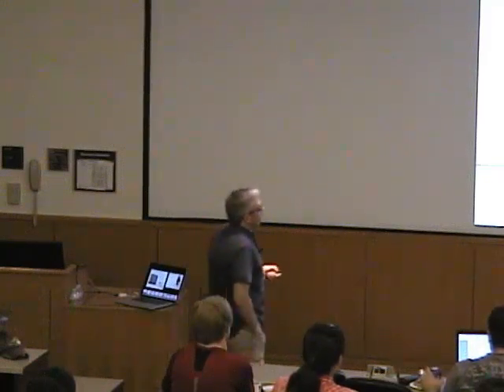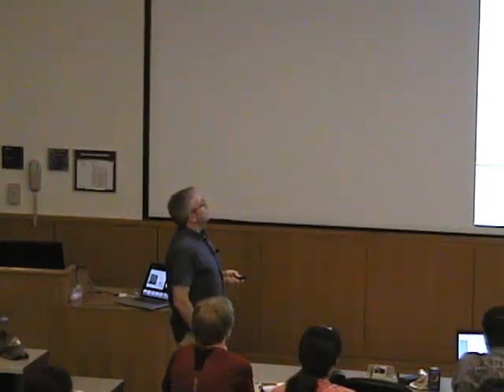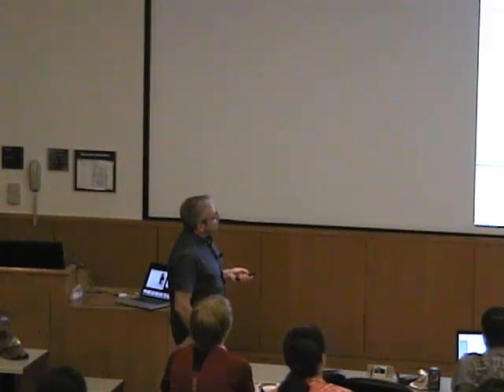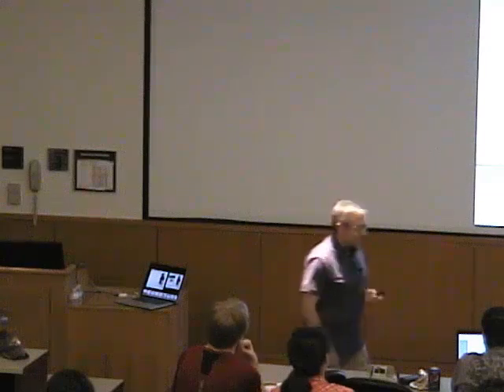But they have changed the game for X-ray crystallography, and have afterwards led to a total change of what you can do with electron microscopy. So this is the method. This is the instrument of choice, the Titan Krios. It has a pretty good name, and it's about 10 feet high, so it's quite an impressive machine.